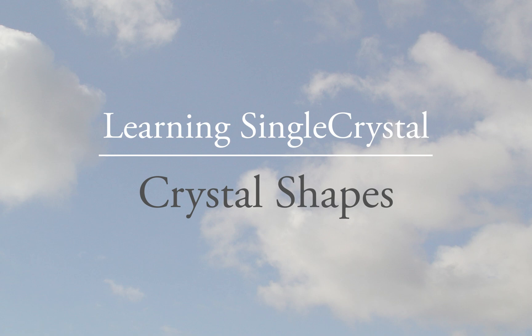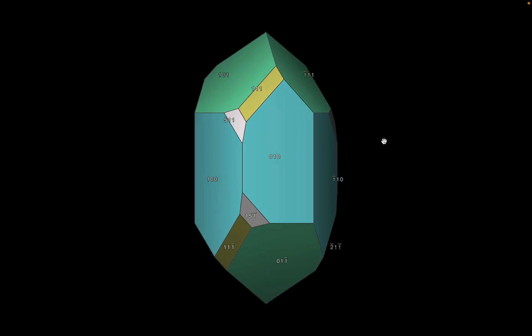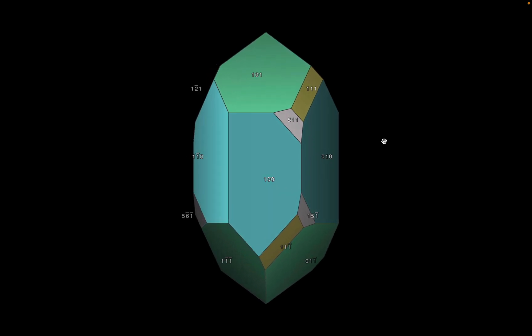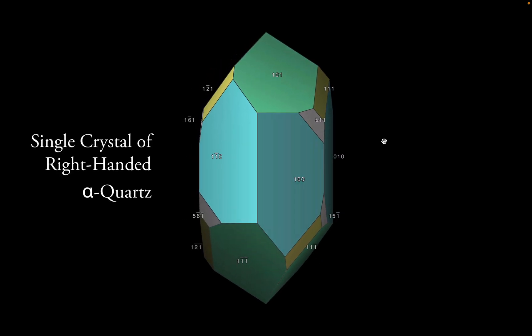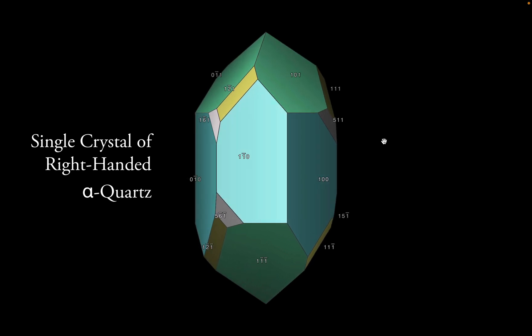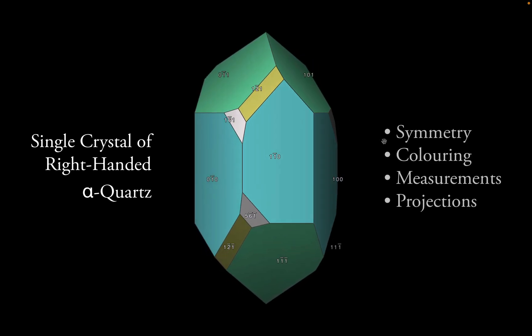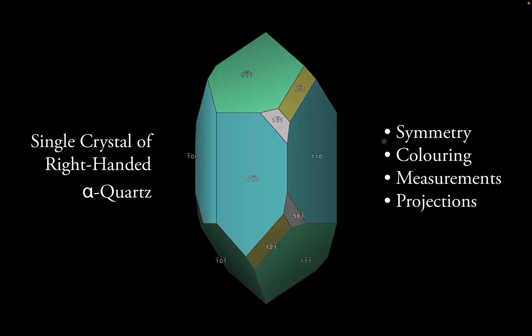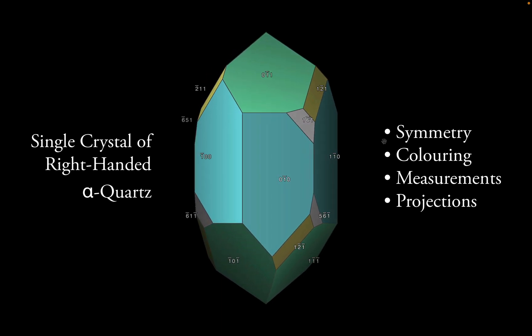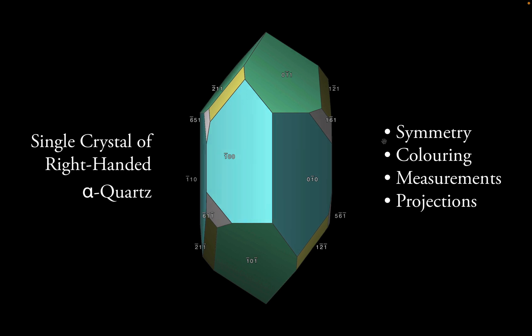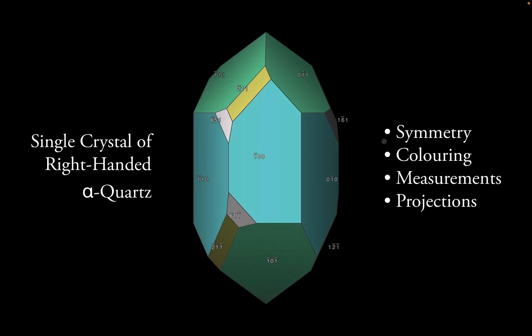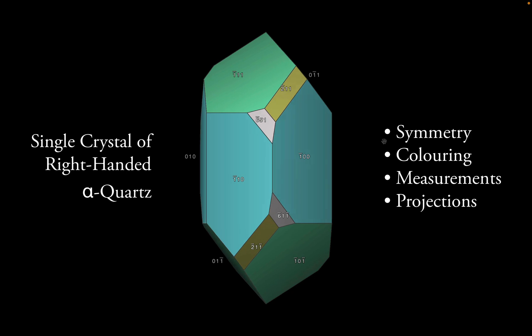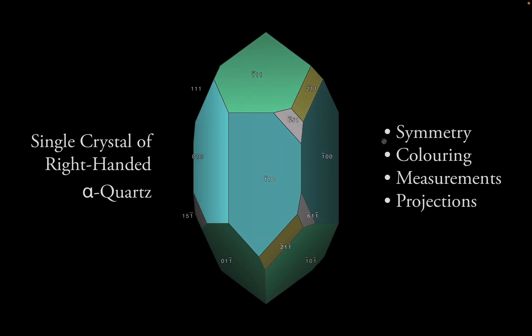Welcome to Single Crystal 5. In this tutorial, we're going to build the shape of alpha quartz in its right-handed form. We'll investigate symmetry relationships, coloring the faces automatically, and how to get information on their relative sizes, distances and surface areas. I will also compare the resulting display with a stereographic projection in two dimensions.